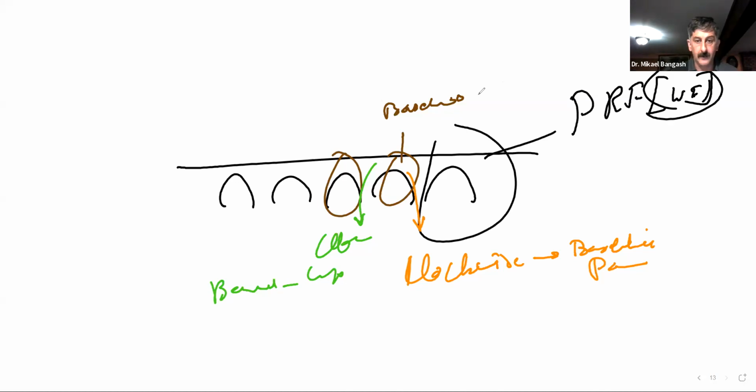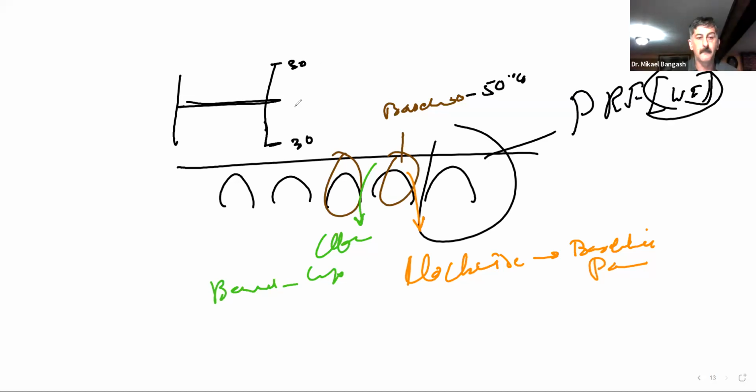Now, usually when you start the system, you may see that it says 50%. Now, what does that 50% mean? It means that it is right in the middle. Where you mainly see that the maximum here, let's say, was 30, this is going to be 30 as well. You can increase this number, or you can increase all of the numbers by increasing the scale.